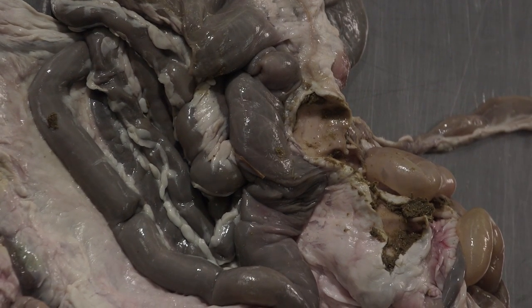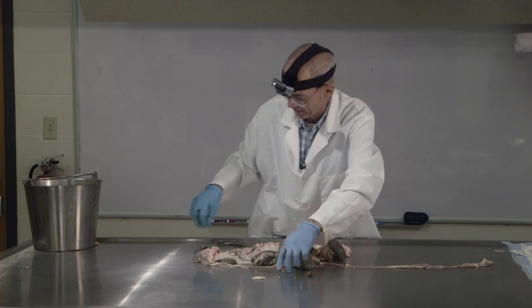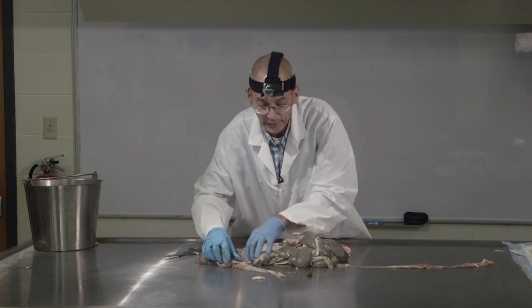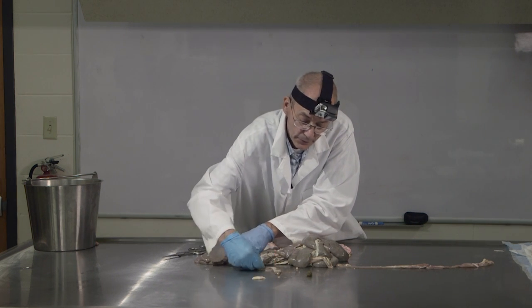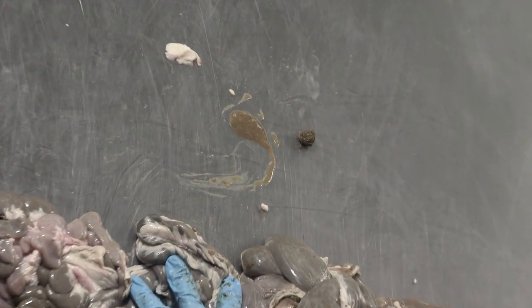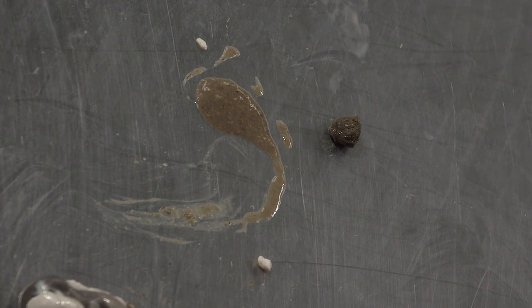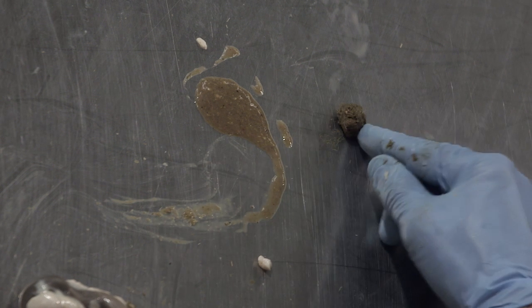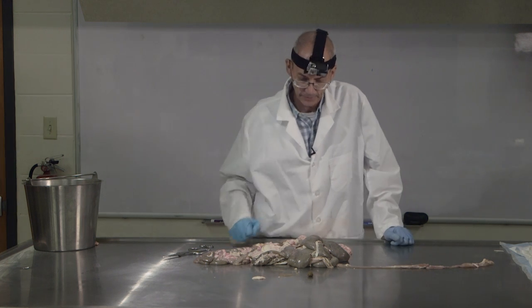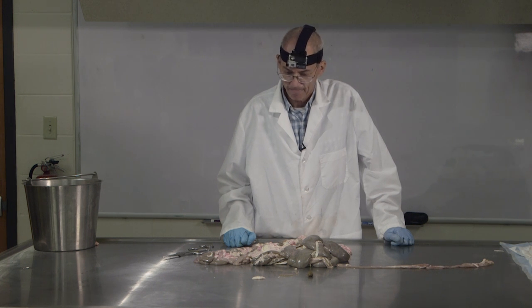Much different from what I think I'll go ahead and show you back in the small intestine. Or let's take it from here, where here's the ileocecal junction, or very close to it, and here's what the food material looks like there. Okay. By the time it's passed through the spiral colon and on into the lower part, the distal part of the colon, and we've had all the water reabsorption, then you can see how much drier it is, and it's actual fecal material. Okay, so I think that very clearly shows you how effective that is at water reabsorption. That's it, guys.